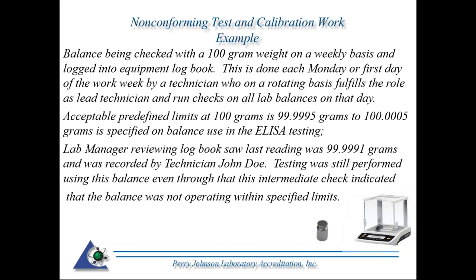On this particular balance, in this scenario, predefined limits at 100 grams are set between 99.9995 grams to 100.0005 grams. In other words, plus or minus 0.5 milligrams. It's specified on this particular balance, which is used in ELISA testing. The lab manager, in reviewing the lab book, saw the last reading was 99.9991 grams and was recorded by technician John Doe.